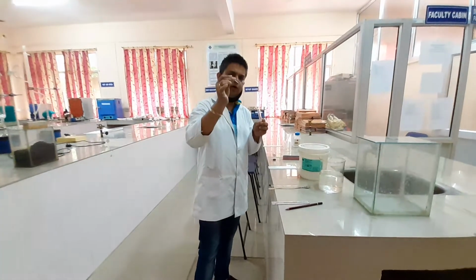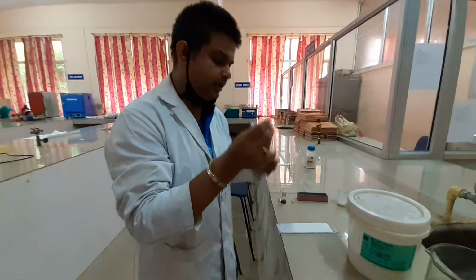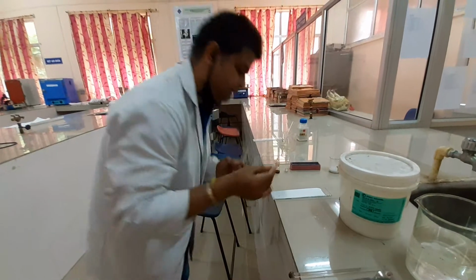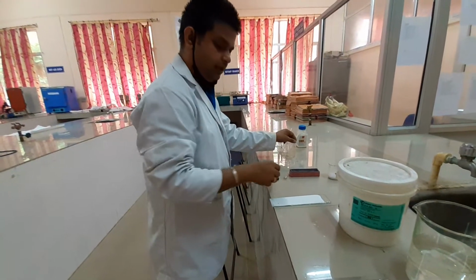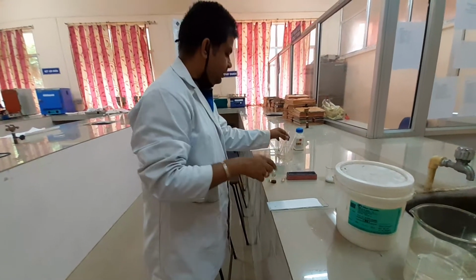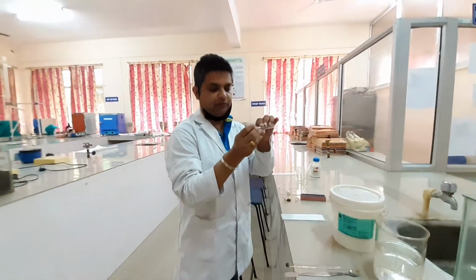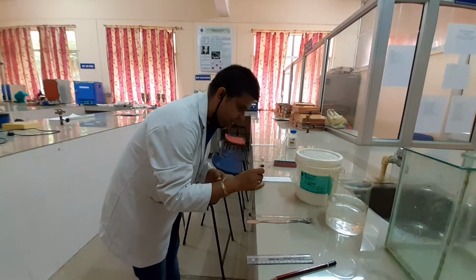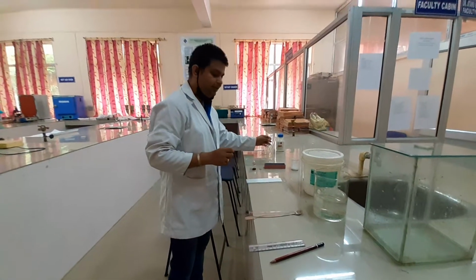With the help of the capillary tube, you take a little quantity of standard and you put the applied sample here. Now take another capillary tube, and this is the mixture of amino acid. A little quantity of the mixture of amino acid you take, and again you put it drop wise on the silica gel. Now wait for some time till it gets dried.